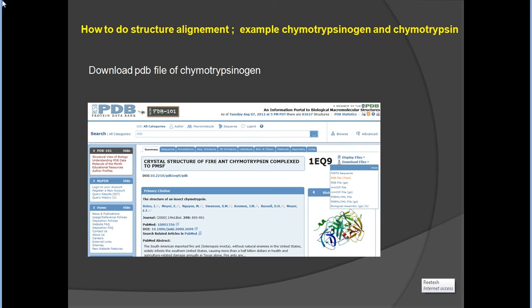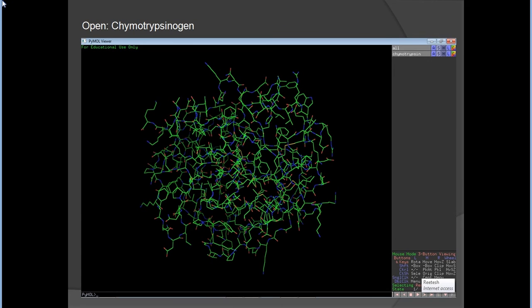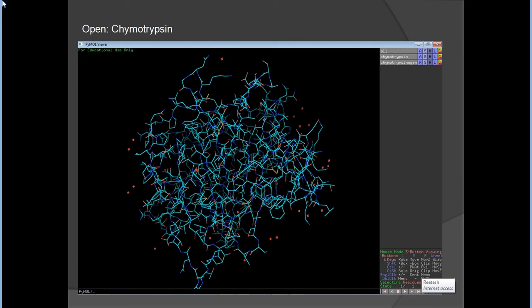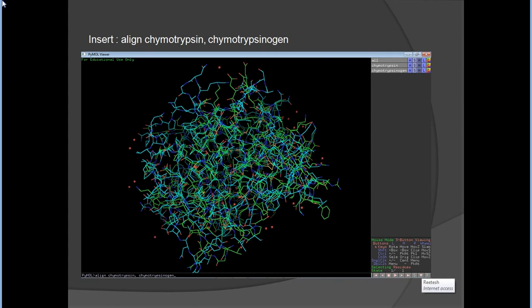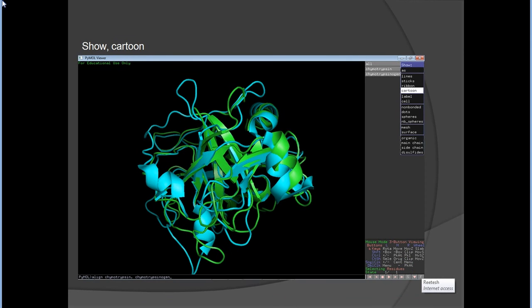For structure alignment, I prefer to use chymotrypsinogen and chymotrypsin. Download the PDB file for chymotrypsinogen from the Protein Data Bank — I already have 1EQ9. Open chymotrypsinogen in the same window as chymotrypsin. To align them, type 'align chymotrypsin, chymotrypsinogen' or vice versa. Then hide everything and show cartoon — you can see both structures are aligned to each other.